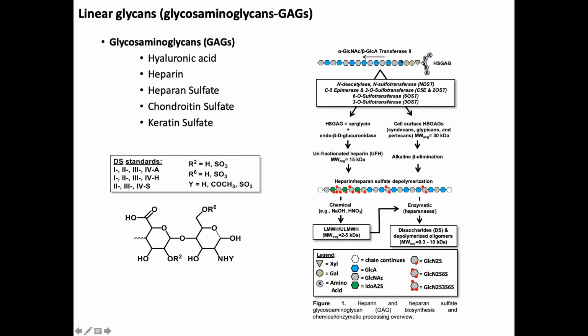And so when I run that by mass spec for shotgun, I want to know what the peptide is, but I also want to look for that residue on that peptide. And if it's there after chondroitinase treatment, I know that was a chondroitin sulfate glycosaminoglycan. Then the other way is you treat with heparinase 1, 2, and 3, and if that's gone, then you say, yep, that was heparan sulfate. So you can use enzymes in that way, and it is used that way.